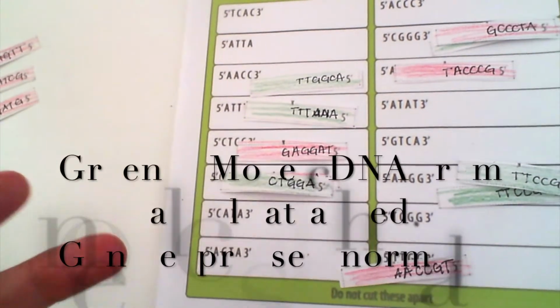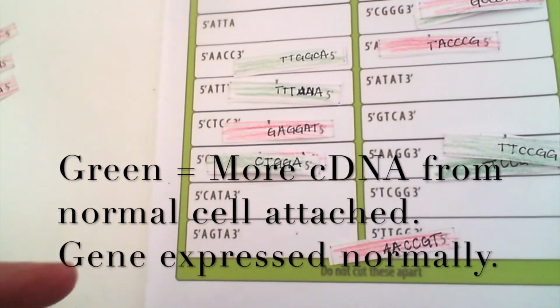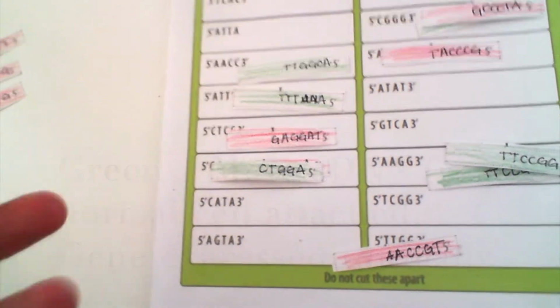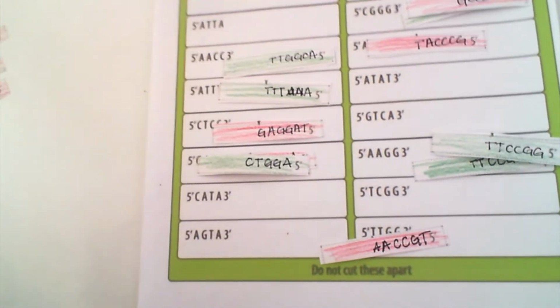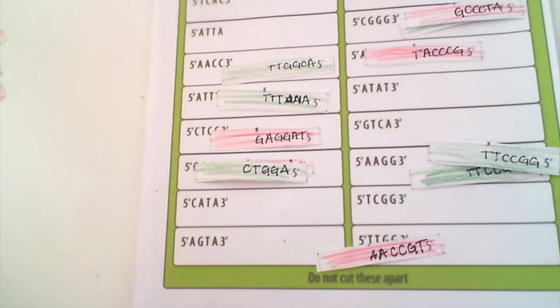If it was green, then that means it is working normally, or expressed normally, in normal cells or the plant that was grown in the sunlight.